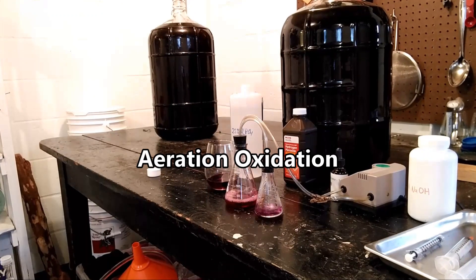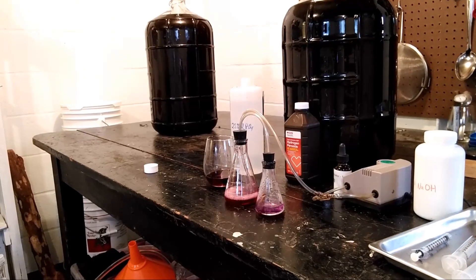Now there are a few ways you can test SO2. I've previously shown you how to use the aeration oxidation method, and that's a pretty inexpensive method, but it's also kind of slow. As you get deeper into winemaking you might want a little bit more convenience, or if you have a small winery you want to be able to rip through those tests really quickly.